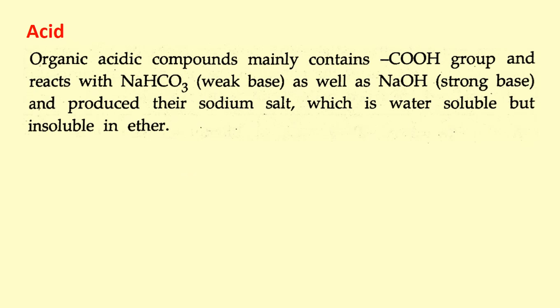Organic acid compounds mainly contain the COOH group and react with bicarbonate as well as the strong base sodium hydroxide. They produce their sodium salt, which is water soluble but insoluble in ether.